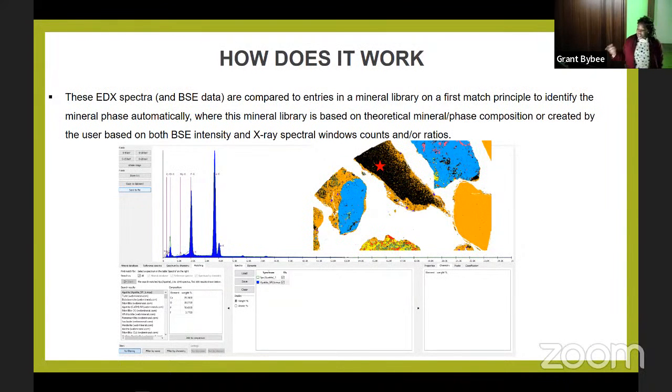Think about if you're analyzing a mineral that is closest to quartz, you can have contamination of the silica within that. And then what happens when you want to match your unknown with the database, in some cases, it gives you a list of minerals, right? So it's very, very important for the person who's using TIMA to study under the optical or light microscope, do that petrographic work very well, and then plan your TIMA work before you can actually analyze your sample.